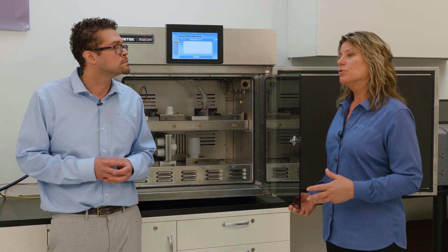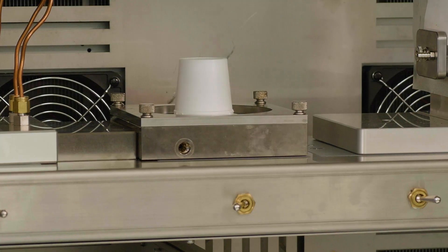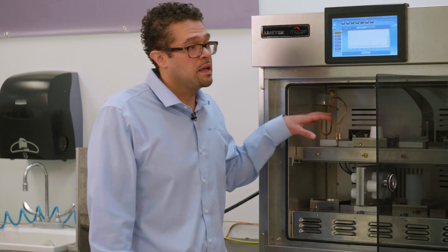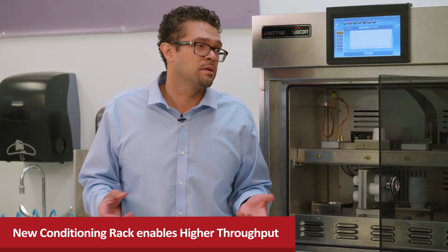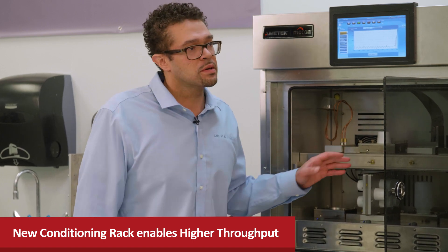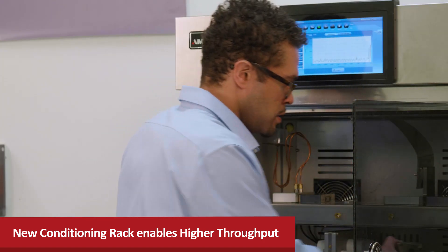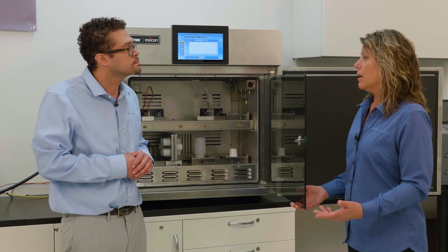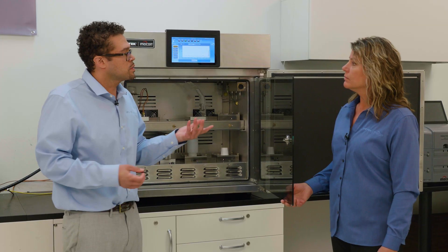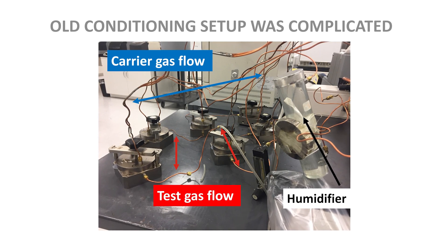What specific feature helps customers increase throughput when testing packages? What we have here is a conditioning rack. This is an optional feature with this instrument that allows one to actually condition in the real test environment. A lot of customers do a lot of flushing offline, but they're not actually in the test environment. What sets this apart is that the time to reach equilibrium is going to be very minimal — say you've been running in here for two days, it's just a quick disengage, push one button, push another button, and now you're ready to start testing. There's no more dealing with Tigon tubing and grease on your fingers and wrenching connections — we've streamlined that whole process.